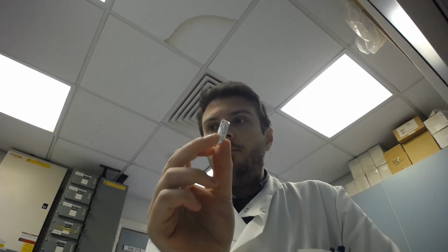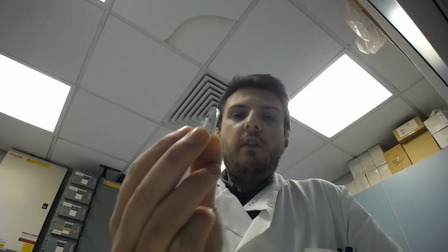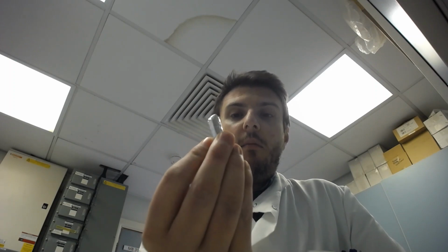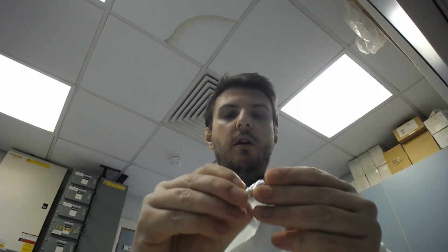Now, when we give out these suppositories, we have to be careful with the sort of counselling that we give. So you take a look at that there. One of the first things we might want to remind the patient is to take it out of the packaging as well. Obviously, you wouldn't want to insert that. It would be very painful, and it wouldn't do its job. So we would advise them first to unwrap the suppository before using it, like so.